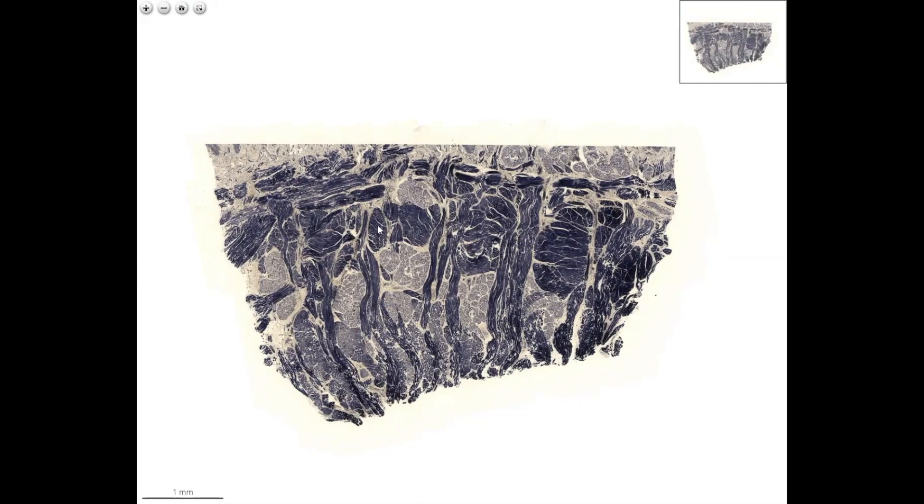Skeletal muscle, striated muscle with iron hematoxylin staining. This piece of tissue was taken from the tongue. In the tongue we have three directional muscles: a sagittal, a longitudinal, and a transverse direction.